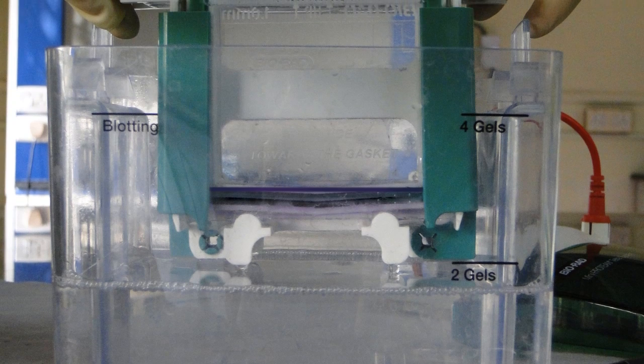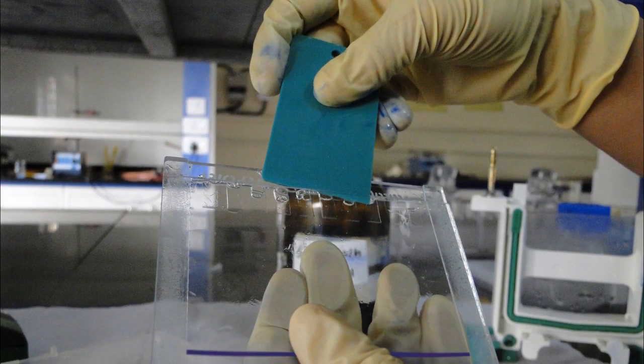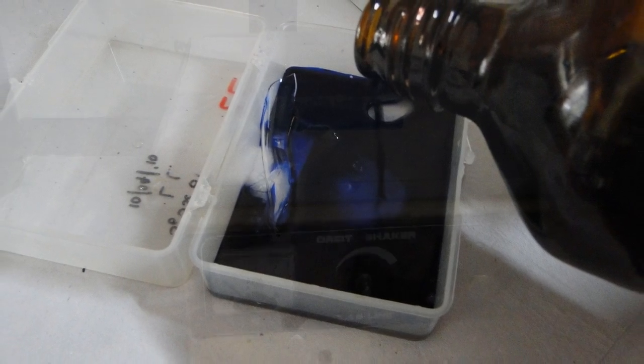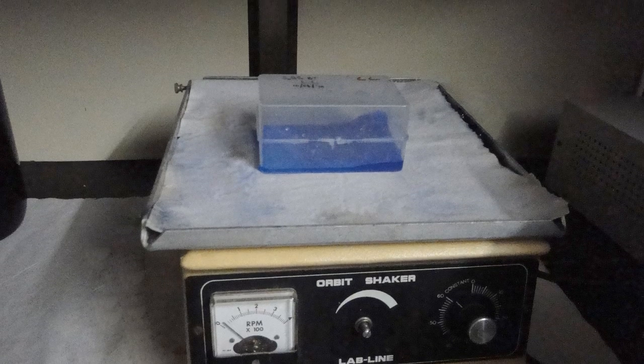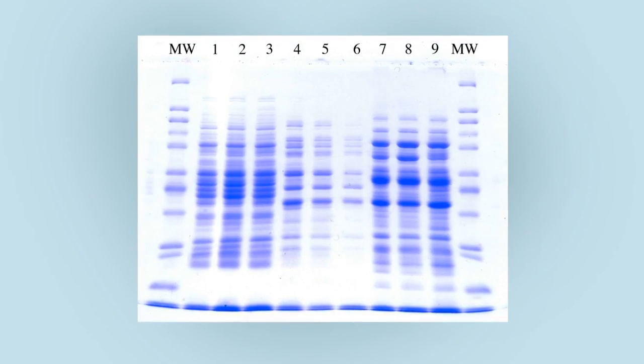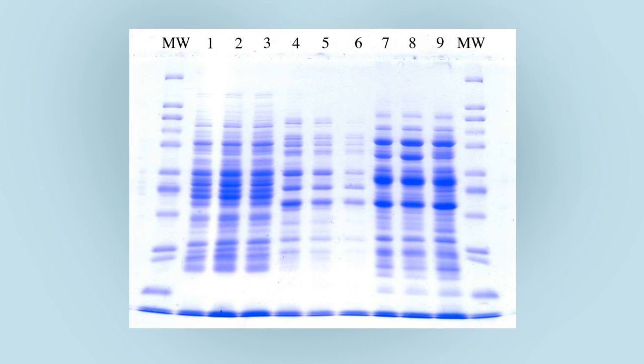For staining the gel, after running, switch off the power supply and take out the gel plates and remove the gel. Place the gel in the staining solution for 30 minutes. De-stain the gel until the bands are properly seen. Approximate the molecular weight of the visualized protein bands by comparing them with the molecular weight markers.